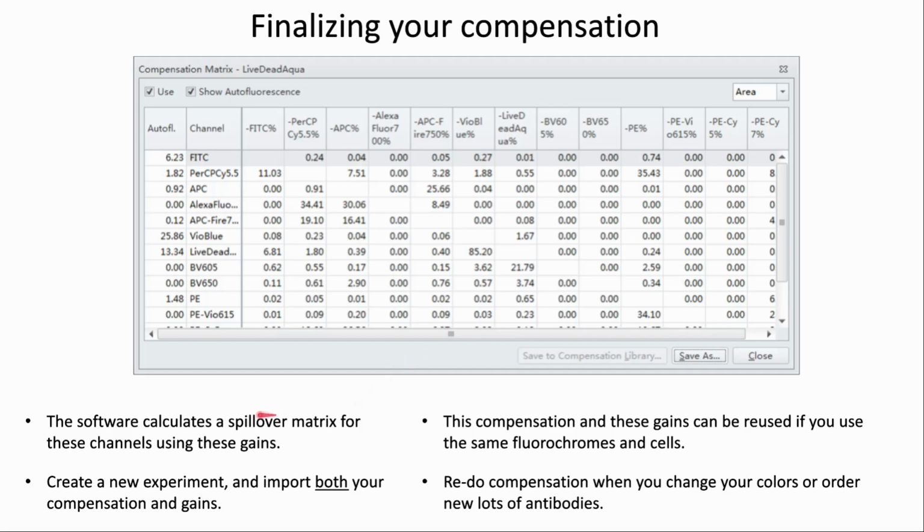It is better to do small conservative changes. Don't shoot for 1,500 or 2,000 in your gains unless the QC has already set it at that level.